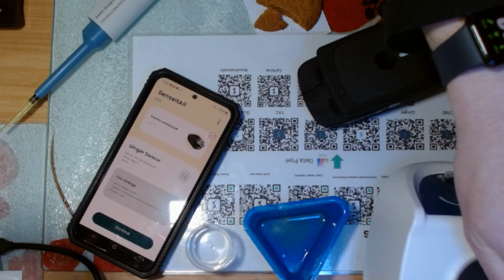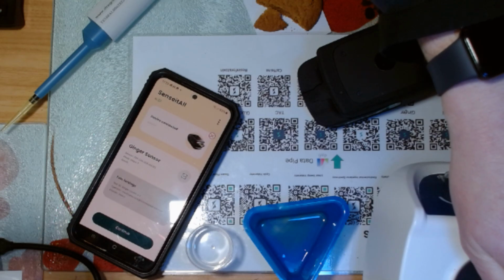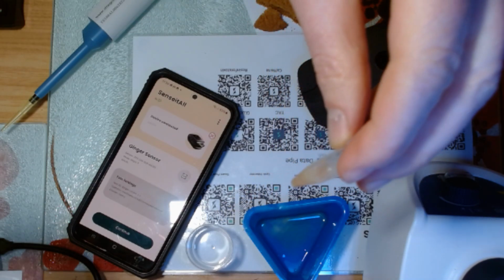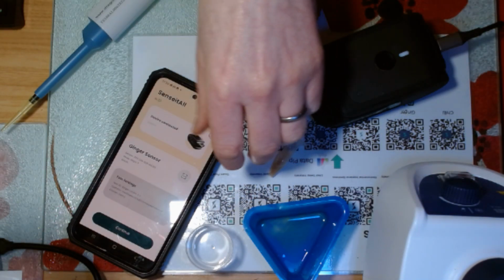I am going to vortex it. These benchtop vortexes really should only cost you £100, €100, $100. So I'm vortexing away. I might just count 20 seconds now so you can get a sense of how long this is going for. 1, 2, 3, up to 20. All right, so there we are. We've got a mushy suspension now of ginger biscuit, ginger cookie, in the buffer.